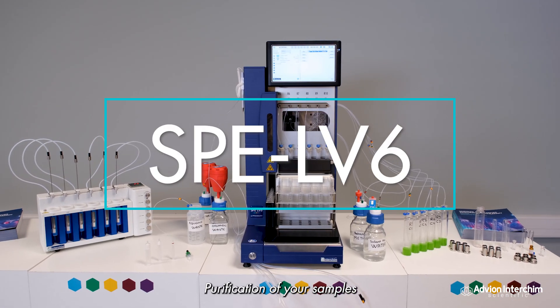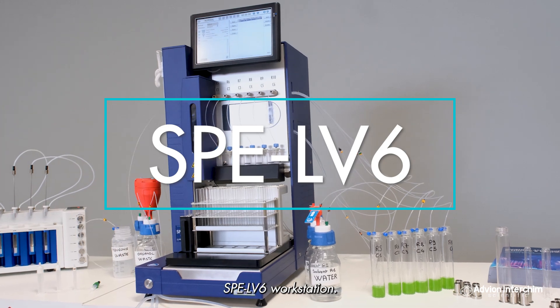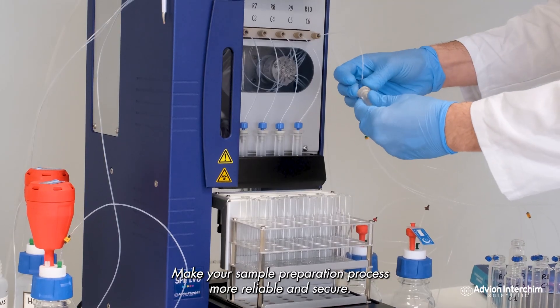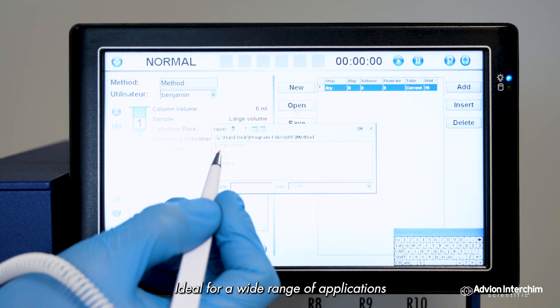Purification of your samples is easier and safer thanks to our new automated SPE LV6 workstation. This compact solid phase extraction system makes your sample preparation process more reliable and secure.